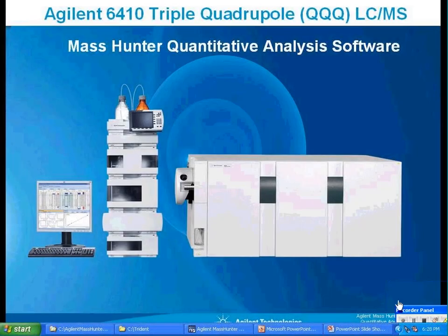Talk about managing your method and updating your method. There are times when, especially in LCMS, your retention time, for example, could change from batch to batch. How do you manage that using the application?